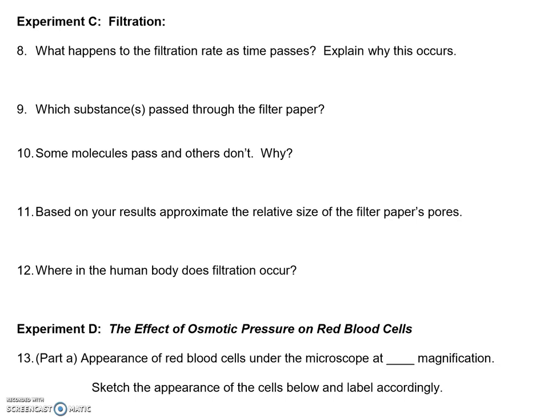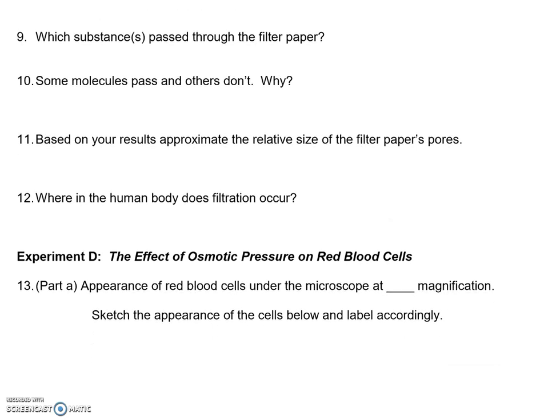Also, starch particles, for example, tend to clog up the pores of the filter paper, and that also can slow things down considerably. If you filtered coffee, then you would also notice that in the beginning, the coffee runs a lot faster, and then as the water column in the filter paper gets smaller, it slows down.